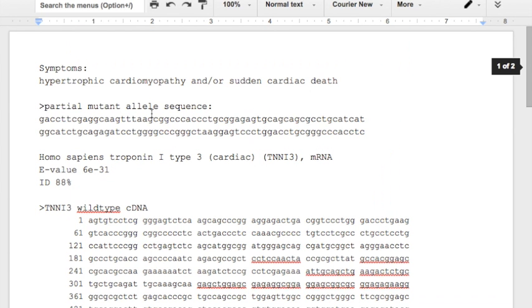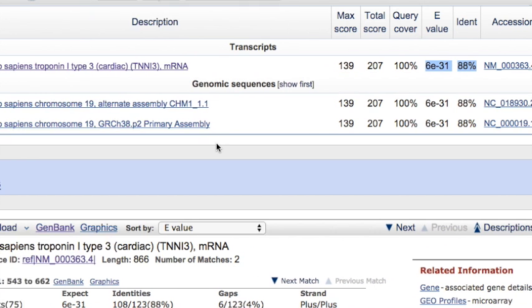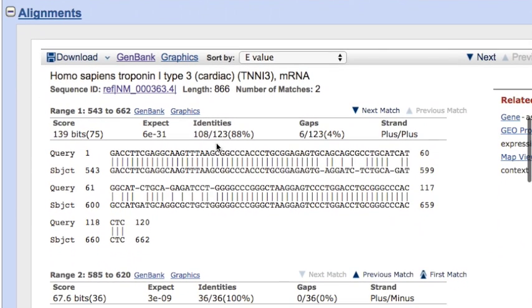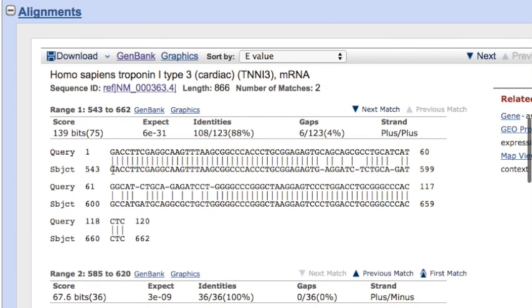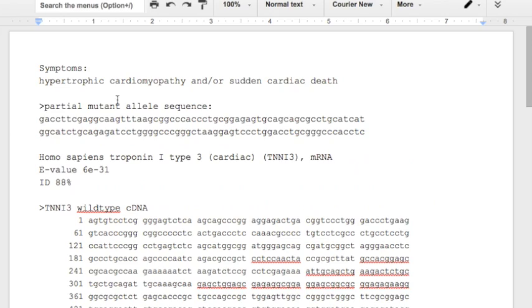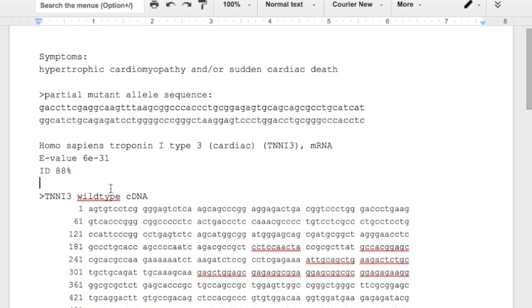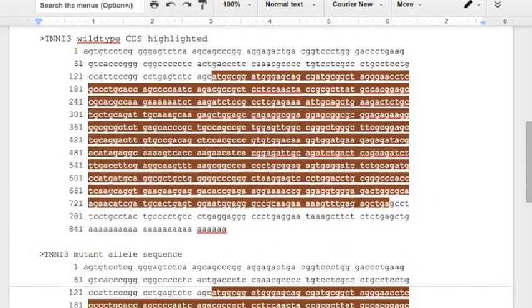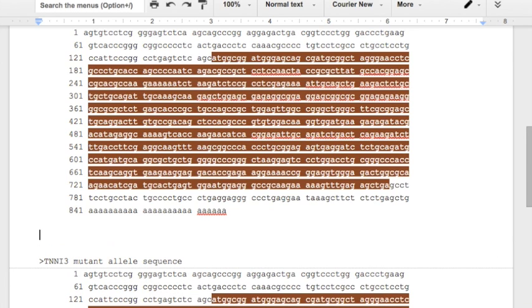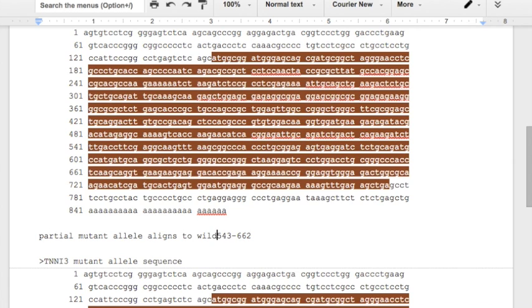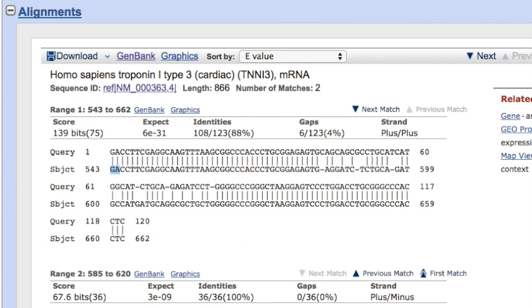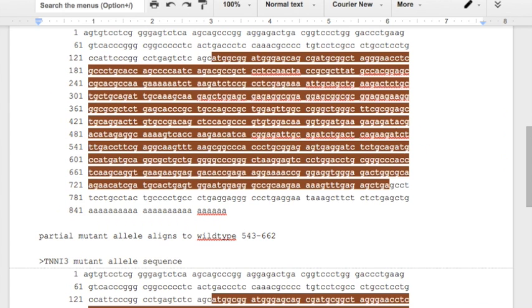First, we have this partial allele sequence, and we do know where this aligns to. If we go to our BLAST results, we can see that that sequence aligns to nucleotides numbers 543 all the way to 662 of the wild type sequence. So 543 to 662. Let me write that down really quickly. 543 to 662. Partial mutant allele aligns to wild type. Those nucleotides, let me double check that. And there we go.